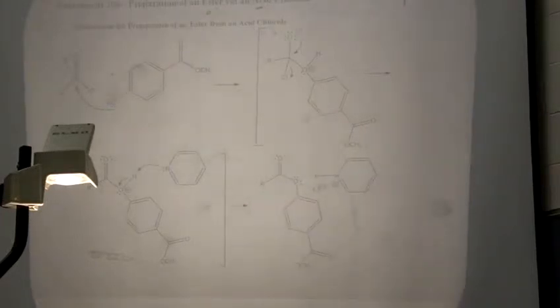And so what we're going to use is pyridine. It will deprotonate our oxygen here, and deprotonation will go on and form our ester just like we wanted, okay? And then we get the pyridinium ion and chloride salt that is formed. So it's no longer pyridine. Once it reacts, it's a pyridinium ion that's counterbalanced with the chloride, all right?